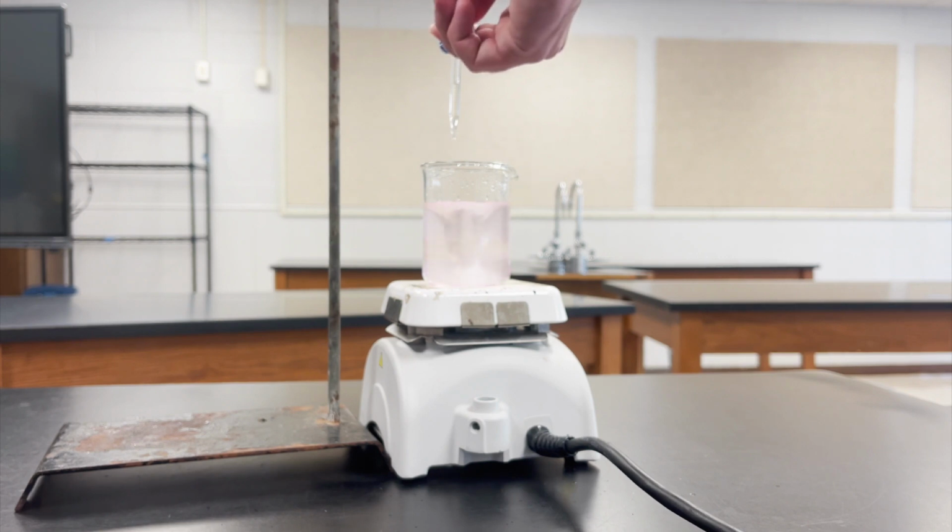So notice how the pink is lingering. Okay, so the pink is starting to linger a little bit longer. And so what we're gonna do now is go by half milliliters. We've been going by 1 milliliter this whole time.